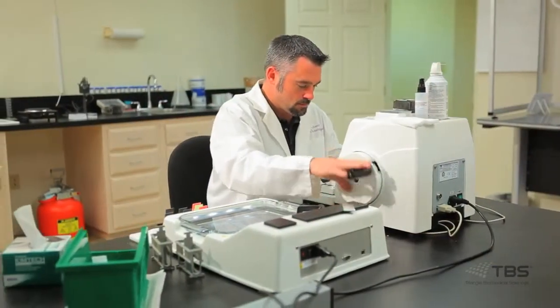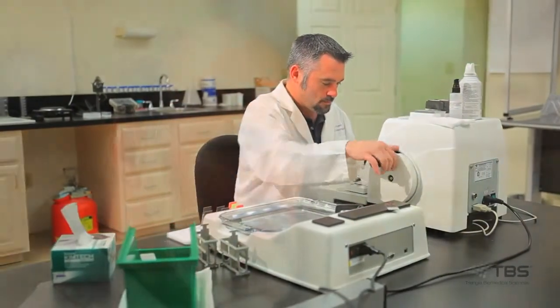This is the most comfortable microtome I have ever used. I have less joint pain after a long day of microtomy when using the TBS SureCut Microtome.